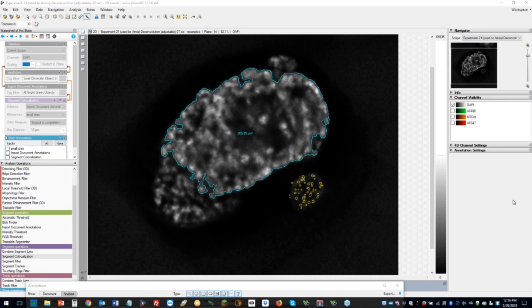I will say I had multiple 12 terabyte images open on my desktop at once. So probably the most amount of data I was accessing at one time was maybe something like 30 plus terabytes.